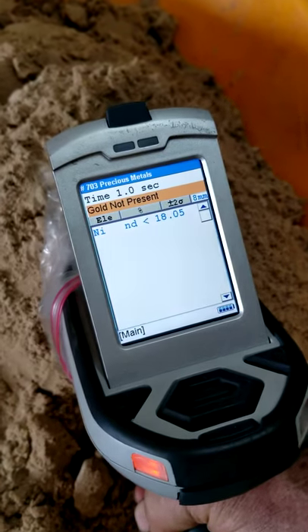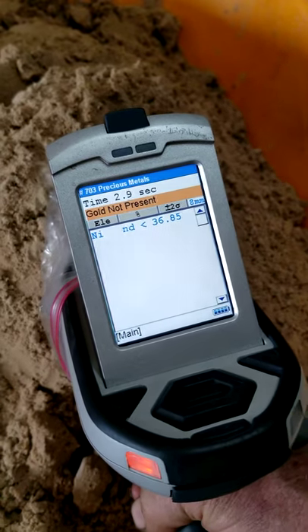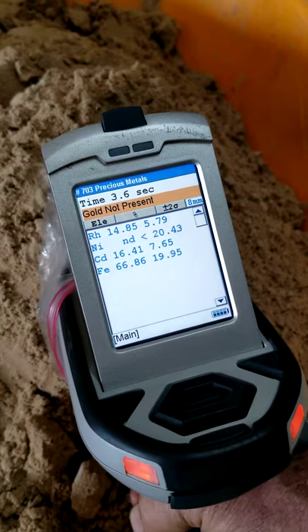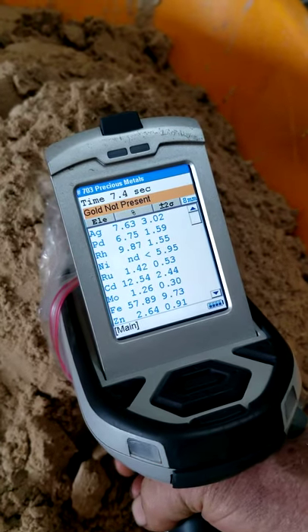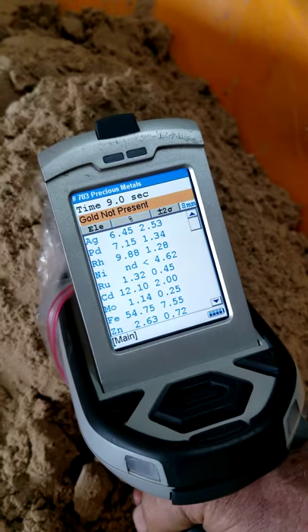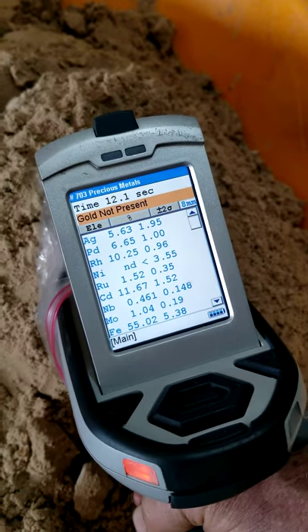What we're doing is taking an actual XRF of the ore. This is raw head ore, never been treated, concentrated or anything. Now very rarely does it ever show gold in the actual ore.